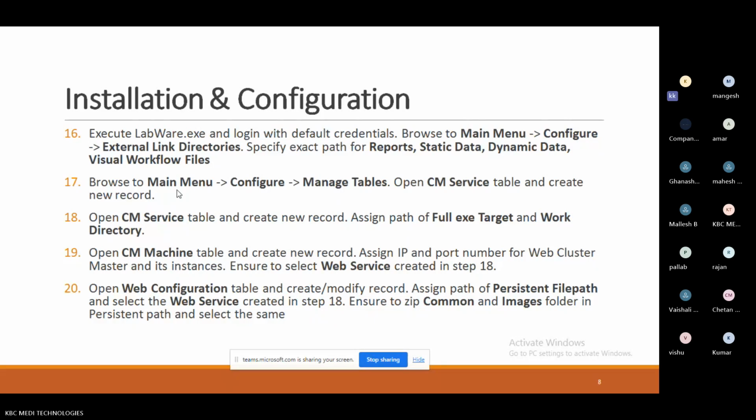When I log in as a reviewer, how should the system act. When I log in as a QA manager, how will the system allow me to work. Those all functionalities come under configuration. Based on your organizational procedure, we are going to do the configuration.